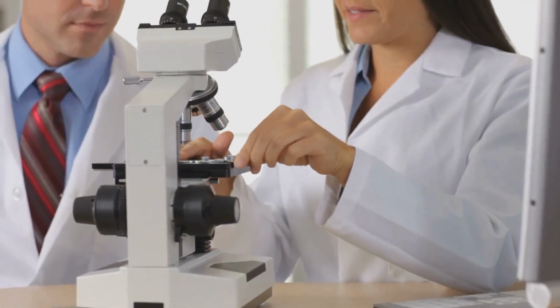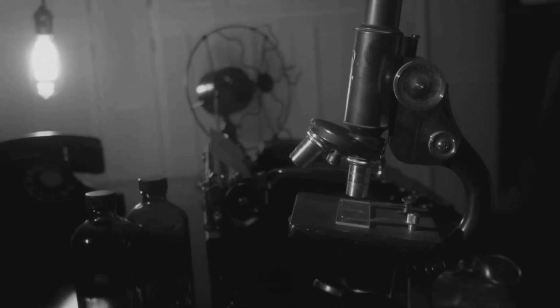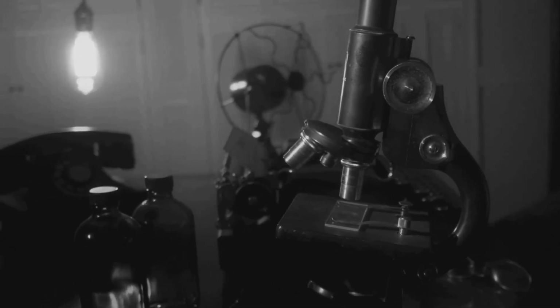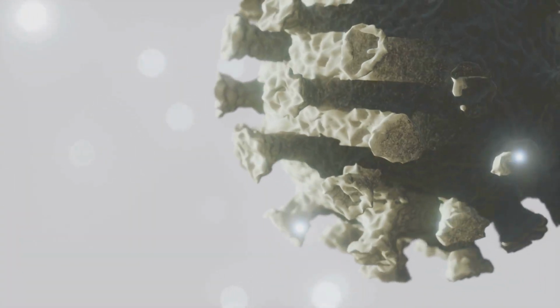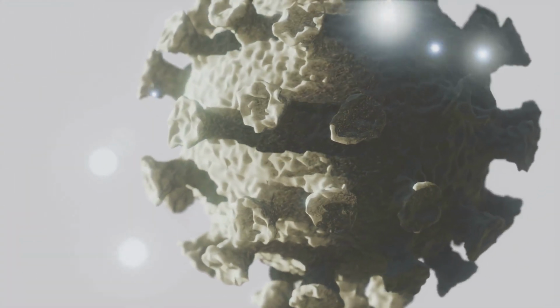Diagram. Path of light through a compound light microscope. The setup is elegantly simple. There's a light source at the bottom which shines up through your sample. The sample itself has to be thin enough for light to pass through it. Above the sample, there are a series of glass lenses. These lenses are curved in a special way. As light passes through them, they bend it, spreading it out. This bending of light is what makes the image of the sample appear much larger.